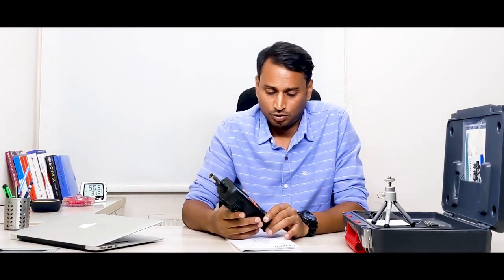So there are 6 channels with which you can do the sampling, starting with 0.3 micron, then 0.5, 1, 2.5, 5 and 10 microns. So it can take measurements up to 10 microns.